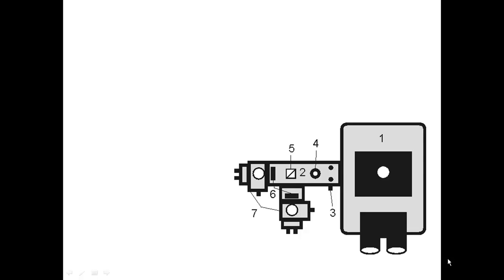Some fluorophores are excited by one wavelength, but they give out light in two wavelengths. These are dual emission fluorophores. One common example is Indo-1, which is used for measuring calcium concentration. If you want to measure two emission lights, then you need to have two photomultiplier tube detectors, and you need to have a mechanism to separate the two wavelengths. The configuration of such a system looks like this.